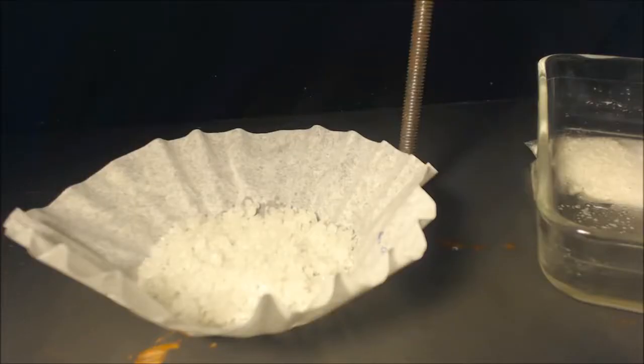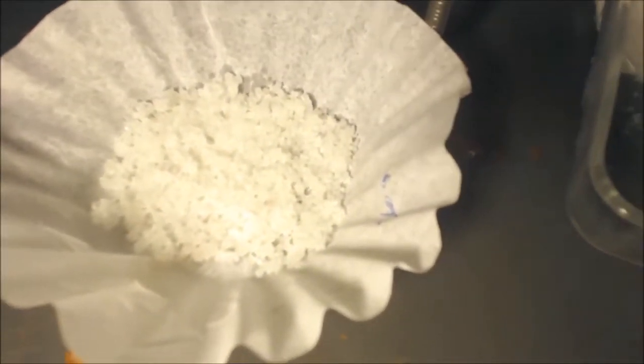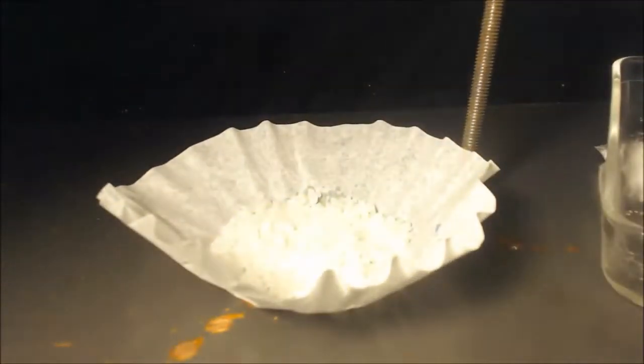Well, anyways, this is what crystallized out first. And it's about 26, 27 grams. Now, I should have got 49 if it was a perfect reaction. But remember, this was my first attempt. Don't think that just because I didn't use acid that the aqueous permanganate reaction doesn't work good. It works just as well. You just have to reflux it maybe 15, 20 minutes more or something like that.